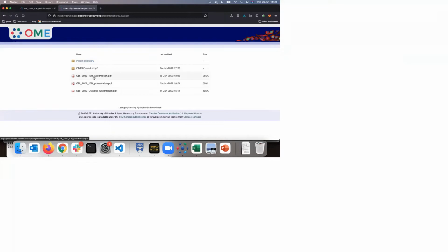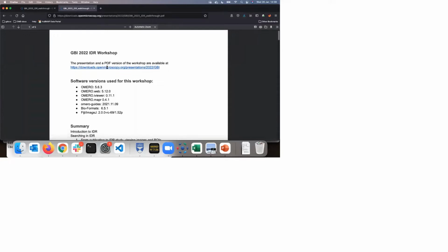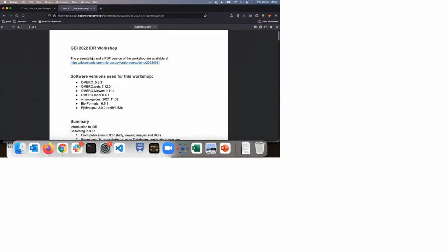Today, obviously, we have the IDR day, and the presentation is here as the PDF, as Jean-Marie highlighted, and this is the walkthrough. Now, I really want you to find that walkthrough, okay? Because this will indeed give you a hand, and if you don't have it, then stop for a second, ask in a chat or otherwise, say that this was not clear, you can't find this very PDF document.